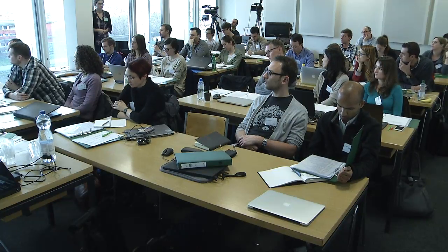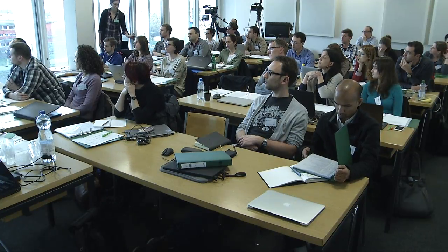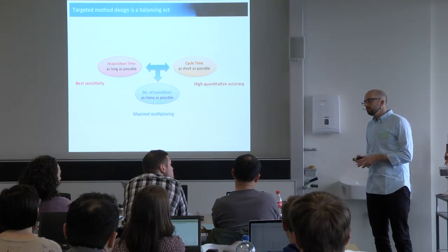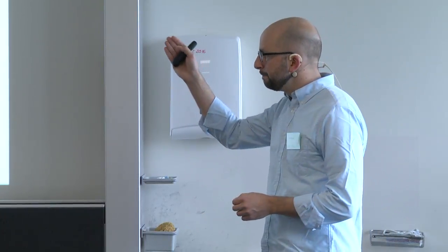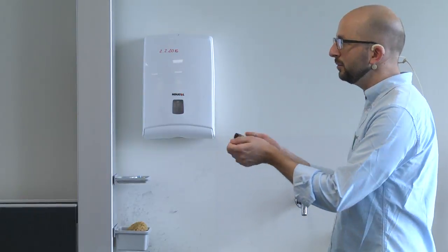I'm not sure, what I mean is, let's say I want to measure for each 2 seconds, and I know that some of the peaks are very intense, so I don't want to accumulate them for too long, I just give them very short, maybe 2 milliseconds, and some are weak, then I give them, let's say, 50 milliseconds. Okay, I understood. So what you're saying is, for some give a long dwell time and for some give a short dwell time according to my expectation. In theory, you can do this. And the machine will accept different values, so it doesn't have to be 20 for all the lines. It can be here 10, here 50, here 100. In this case, what you would still get is that the cycle time would still be the sum of all of them. So you would still need to somehow play, but you don't have to do it necessarily by this simple multiplication. Is that clear? Okay.